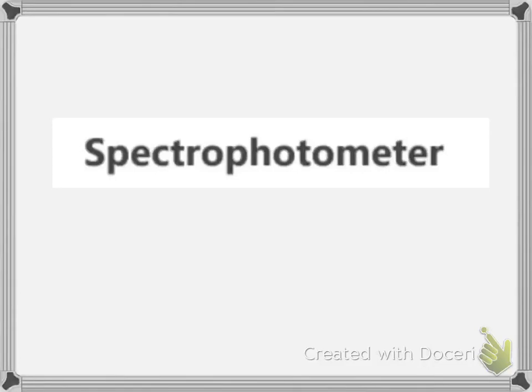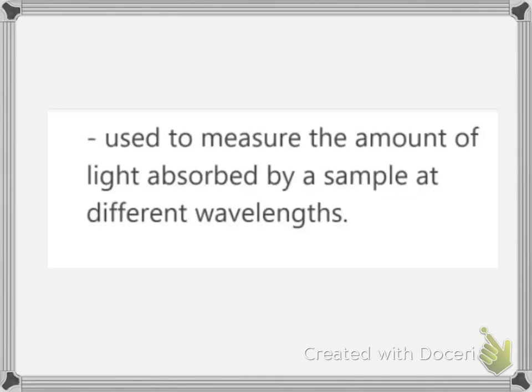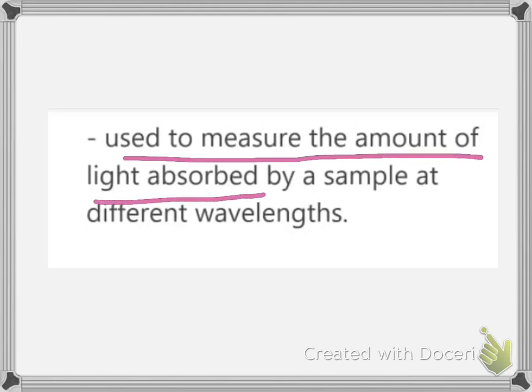In this video, we will discuss the spectrophotometer. A spectrophotometer is a device used to measure the amount of light absorbed by a sample at different wavelengths.